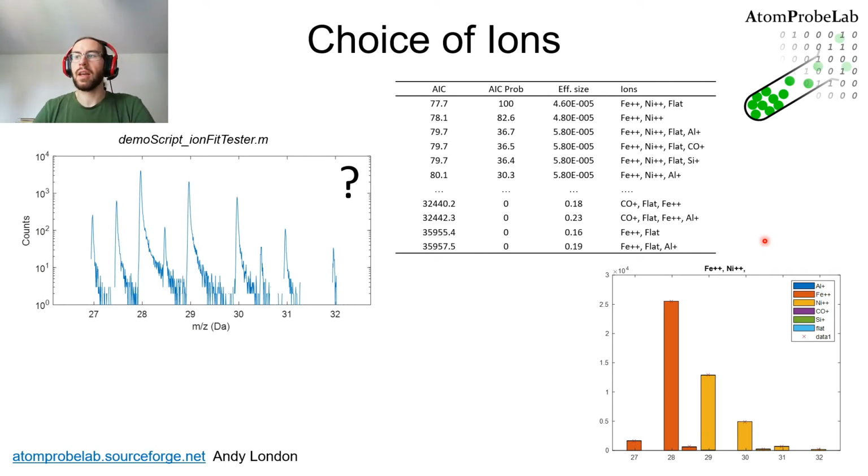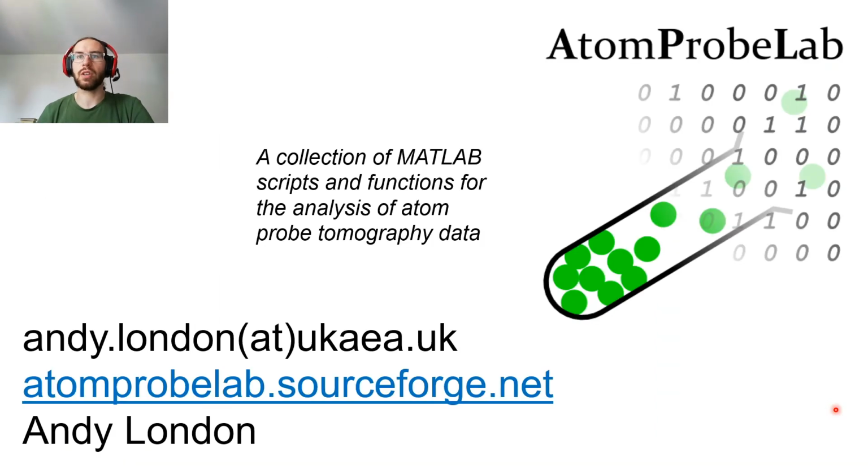in your data. And just out here is an output showing the fitted values, which is the coloured bars, to the observed data. So that's observed from this mass spectrum here, the little crosses. So you can see this fits, even just fitting with iron and nickel, fits very well. And there is just a small amount of silicon which is hidden in there, which we can't see.